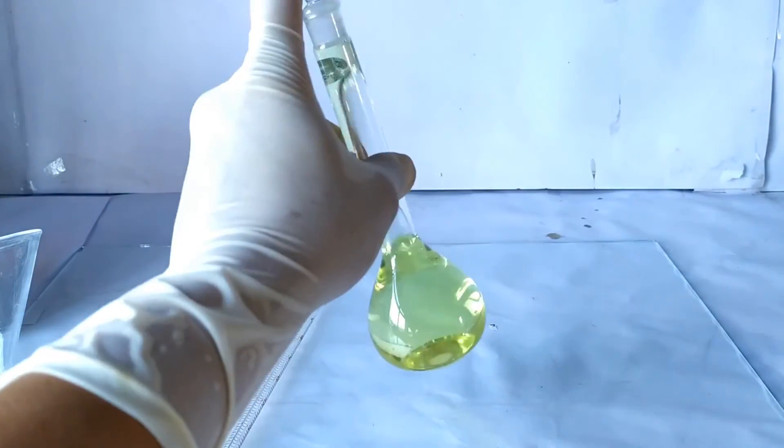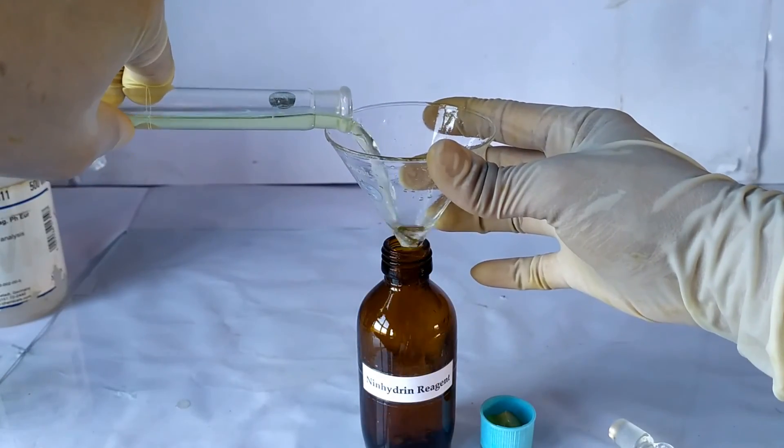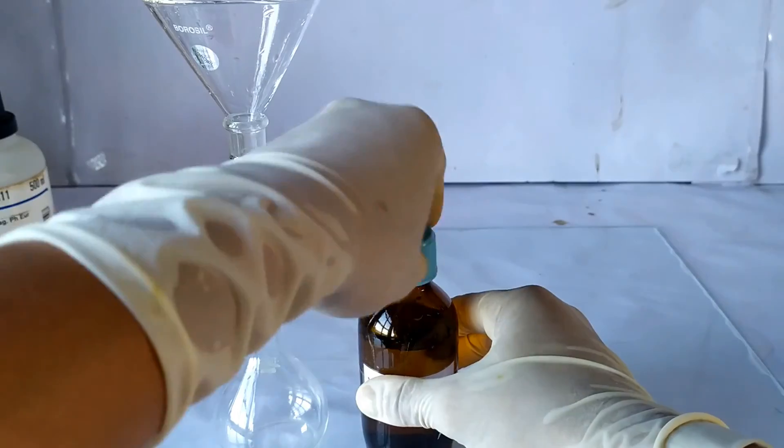Stopper the flask and invert it several times to homogenize the solution. Transfer the prepared reagent into a suitable, well-labeled airtight container for final storage.